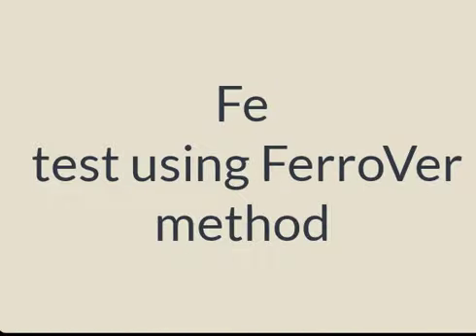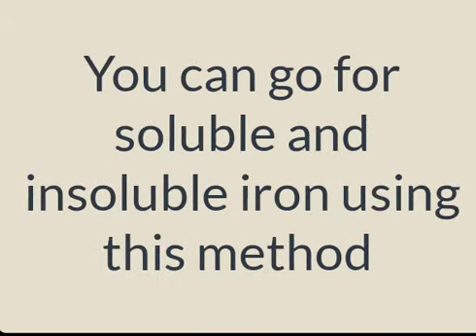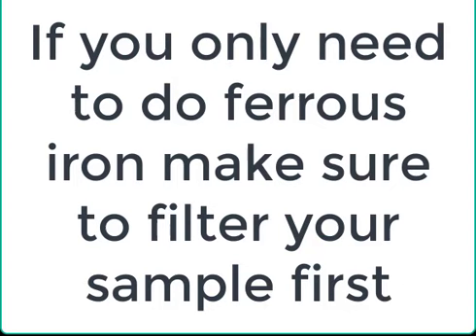One of the test methods that is used to indicate iron is the FerroVer method. You can test for soluble and insoluble iron using this method. If you are aiming to measure ferrous iron only, make sure to filter your sample first.